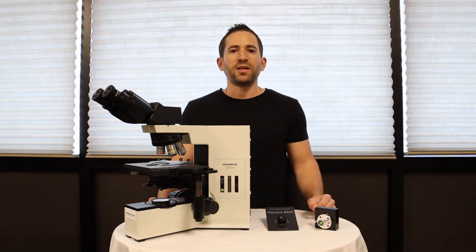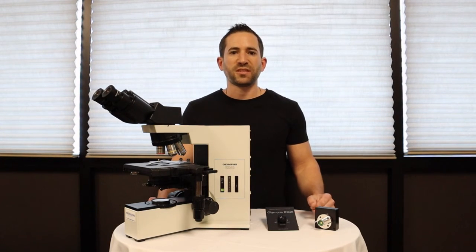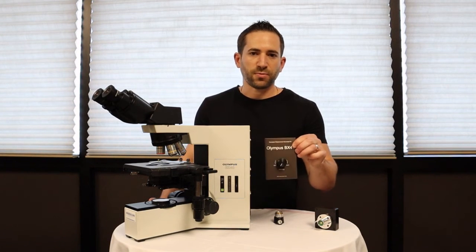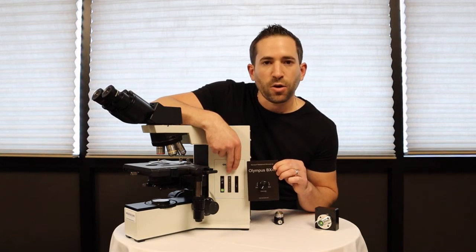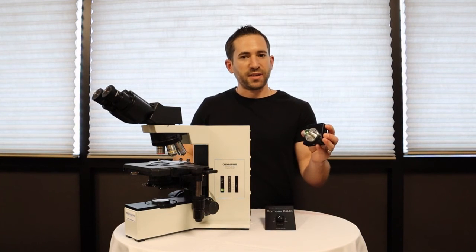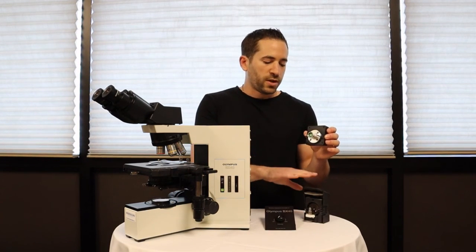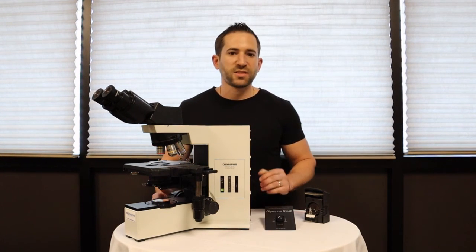This solution is made in the United States, backed by a three-year warranty, and most importantly replaces all of the existing controls you're used to on your microscope. This front board here is the rheostat board, which directly replaces the faulty rheostat on your microscope. This is the LED lamp house, which contains the LED bulb and replaces your old halogen lamp house in the rear of your microscope.